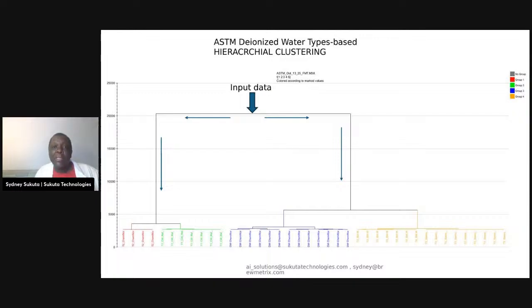So what is this? This is called hierarchical clustering, and a simple way to think of it is a similarity test. If you look at this closely, unfortunately it may not be that clear, but I have another diagram I want to show you.